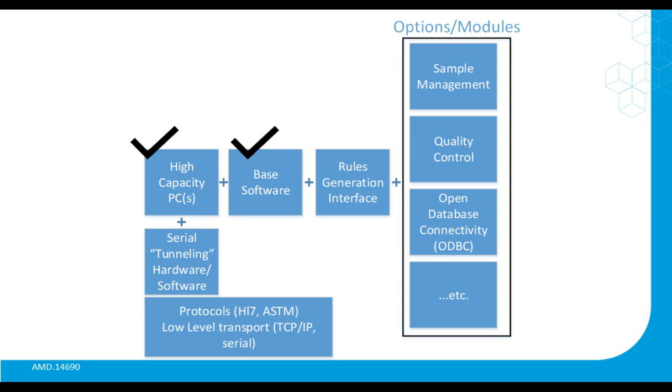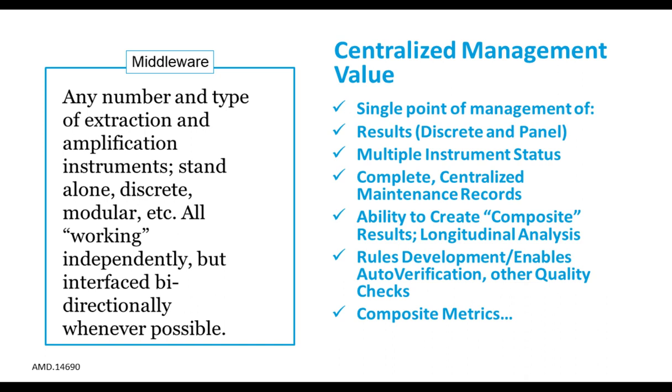Now, oftentimes it's modular, right? And that depends on the vendor, right? It could include things like sample tracking, extended quality control, charting, and providing access to review by other open data sources, and a whole lot more. This all depends on the vendor. But all these additional modules are all capable and resident in various systems out there commercially available. So I wanted to make sure that we kind of demystify that middleware is nothing more than another computer system with rules and modules that govern and give more granular control to lab information, right? This sort of summarizes it as well, right?